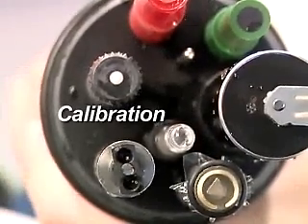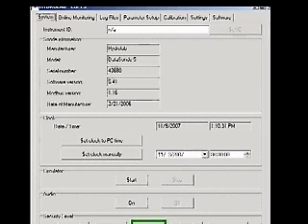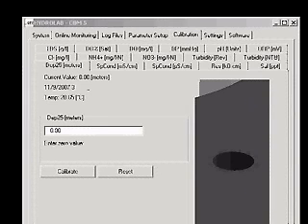Calibration. Establish a connection to the sonde with Hydrus 3LT. Click the button labeled Operate Sonde. When the sonde finishes its initialization, click the Calibration tab. Then click the Depth in Meters tab.